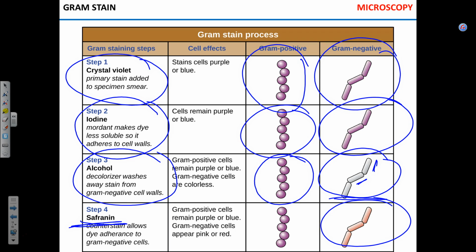But then the host asks her, so what is the first go-to technique in identification of bacterial samples? And she answers just like this: gram staining. So you have a physician supplies the sample, they put it on the plate, they grow microbes, they stain it. First thing, with all the fancy stuff, you have to stain it. So you have to know that. Even if you don't do it, when people from the lab call you and tell you it's gram-positive, you know what they're talking about. Make sense?